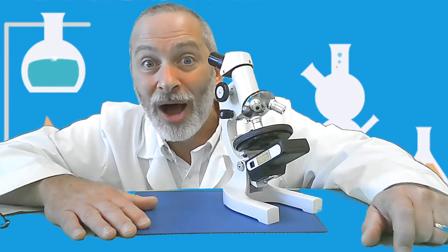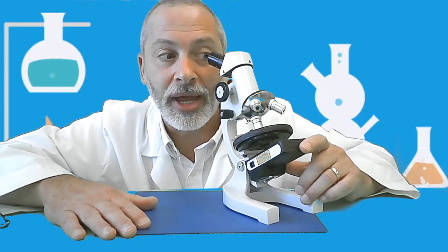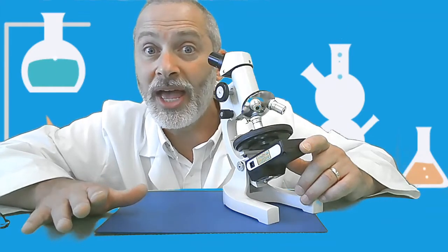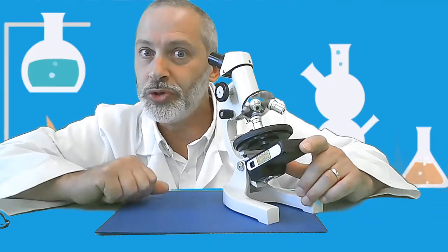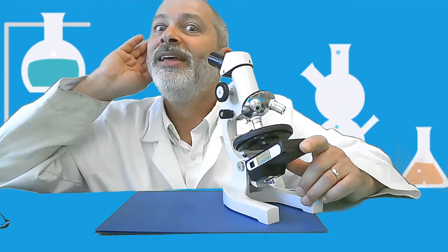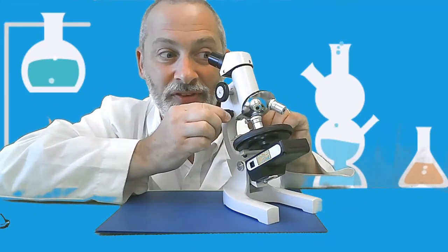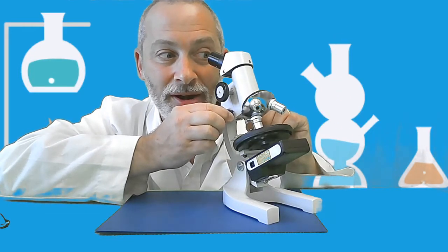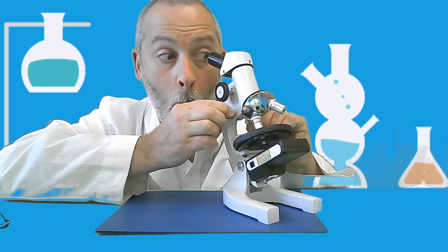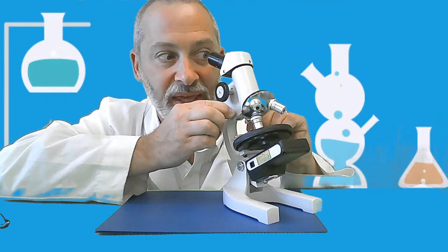Yeah, high power highlight. So I'm going to adjust the light a little bit brighter here. Oh, now I can see things, but it's a little out of focus. That's okay. Which knob should we use to focus our image? Yes, the fine adjustment knob only. So I'm going to adjust the fine adjustment knob so I don't shatter any slides. Oh my goodness. Wow, I had no idea the cells could look this big.